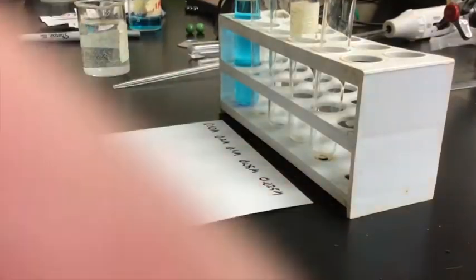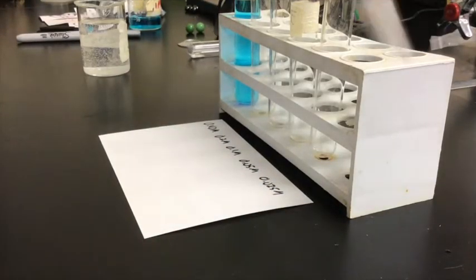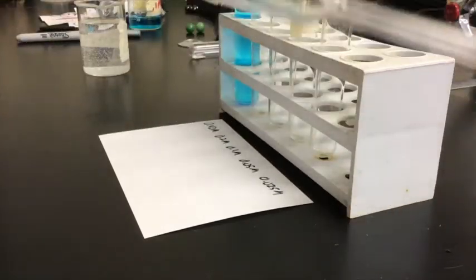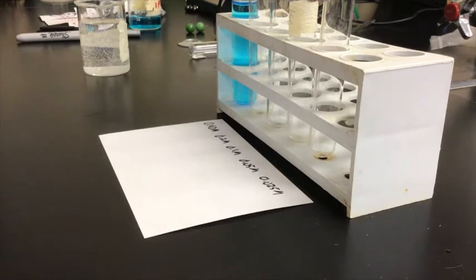So here's what we are going to do. We are going to take our volumetric pipettes, and I've got a ten here, right? And I'm going to put this guy in, and I'm going to use the volumetric pipette to get 10 milliliters exactly of this solution here, like so. So there's 10 milliliters there, and then I'm going to add that in there like so.